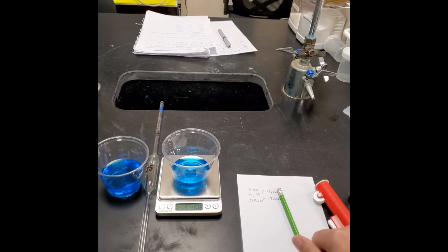Now, when you are done collecting your data, so we're going to do 3 trials with each of the reference solutions and with each of the unknowns, you have to clean out your pipette, and you have to clean it very well because the sugar is very, very sticky. And if you don't clean it, you're going to ruin the pipette. So I'm going to show you what to do when you are done.